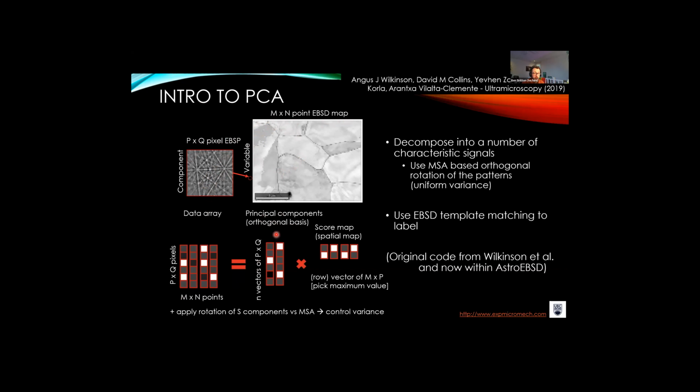It's an orthogonal basis eigenvalue, eigenvector problem to give you the principal components. The strongest principal component is basically the mean of this data. The second is something that is strongly varying from that mean. Specifically, it has this orthogonal quality. And then at every single point in the map, we can have a score which tells us how this principal component relates to this particular point.